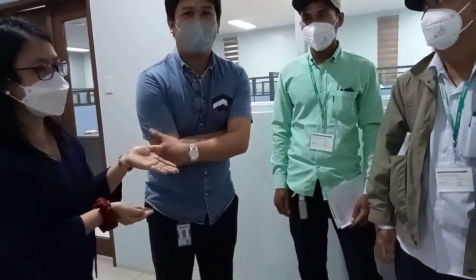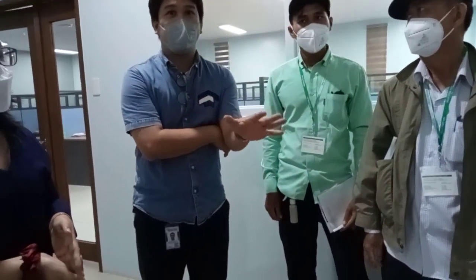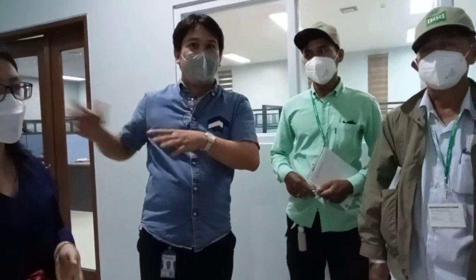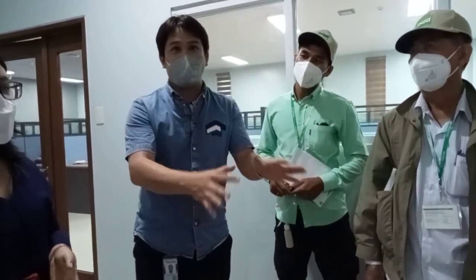We have an integrated management system here. So for laboratory waste, we make sure that it's treated properly and disposed properly as well. So we don't just dispose them anywhere. So there's the right way to dispose hazardous materials in the lab.